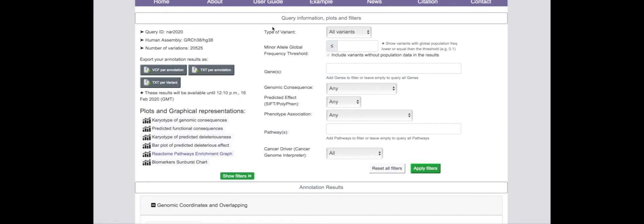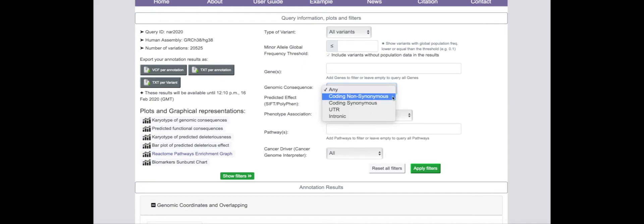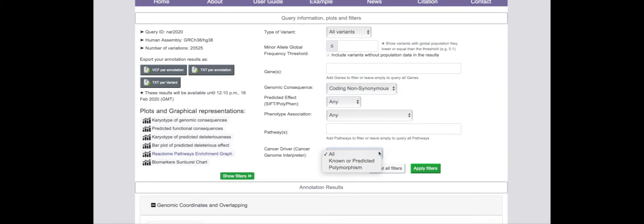But first, to prioritize variants bearing functionally significant consequences for driving tumor growth and progression, all non-synonymous mutations can be easily filtered by their oncogenic classifications to retain only those with a known or predicted driver status.